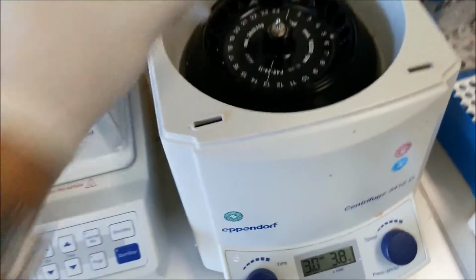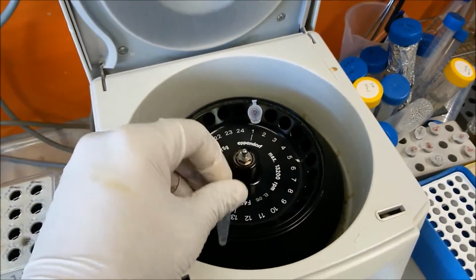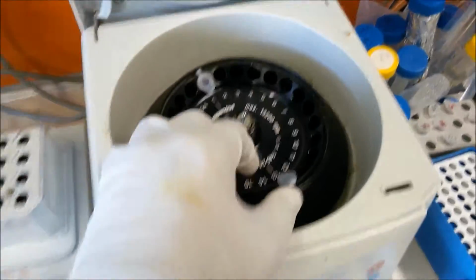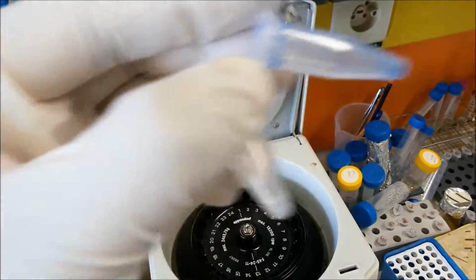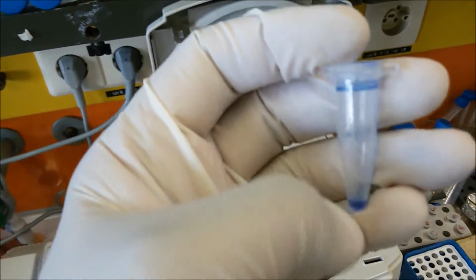So you can see I have 2 tubes. I can put it here, and they go inside, and I can put one here. Okay, so this is a small setup, and this is just a centrifuge, which we use because of the centrifugal force. So for example, if you do it like this, you can see the chemical is now all over the tubes, and you want to recover it, right?